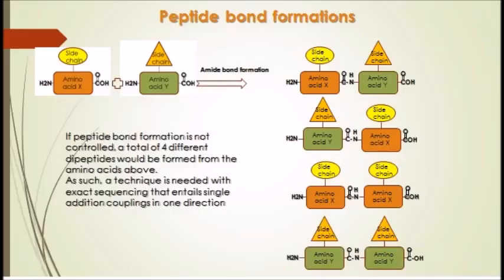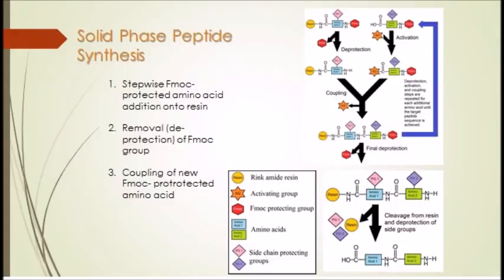Now, solid phase peptide synthesis is such a technique that I've employed in my synthesis. It entails stepwise FMOC protected amino acid addition onto a resin, removal or deprotection of the FMOC group, and then coupling of a new FMOC protected amino acid. Here's a closer look at the stepwise coupling and deprotection procedure.